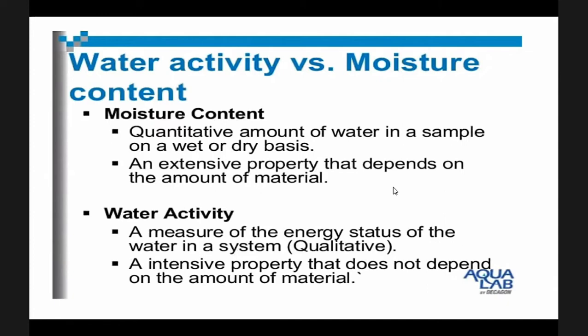If the sample is a slurry or sticky, and it is subjected to moisture determination, it is wet basis. But if it is soil, for example, you air dry it first before checking the moisture, so it is on a dry basis. Okay. So moisture is an extensive property.